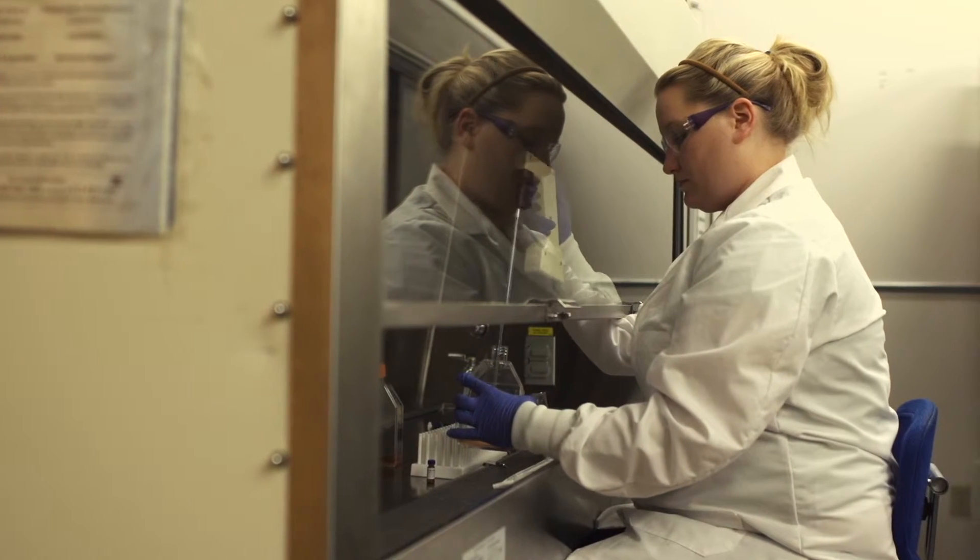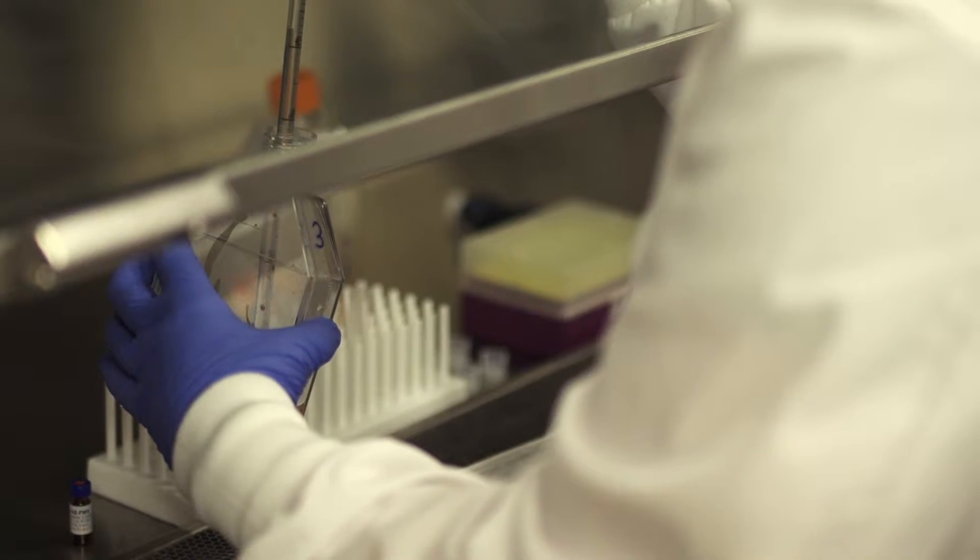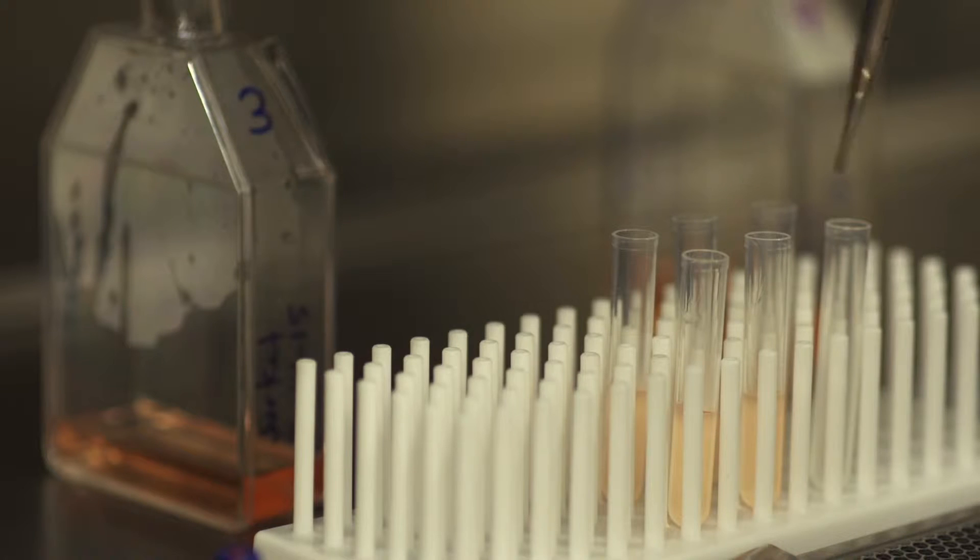To use Magic Red, first grow your cells to your target concentration. These cells can be grown in suspension or as adherent cells which can be trypsinized before staining. Expose your cells to the experimental conditions and induce your positive control.